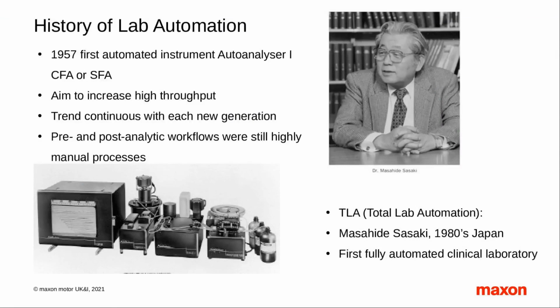So let's just have a quick look at the history of lab automation. Where did it all start? It started in the late 50s, where someone had a great idea to invent a machine called an auto analyzer. CFA stands for continuous flow analysis.